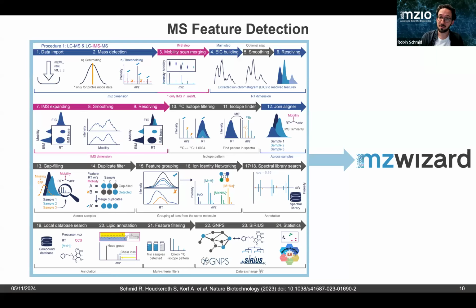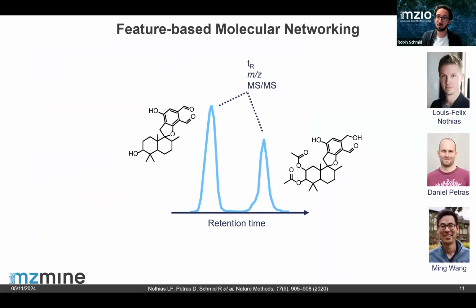Before we jump into mzmine, because today we're also going to introduce molecular networking, there have been great seminars already by VMOL on molecular networking, and I guess we can link out to those on YouTube later. But here I will just introduce the concept quite quickly. Together with Louis and Danny and Ming, we've been working on feature-based molecular networking.